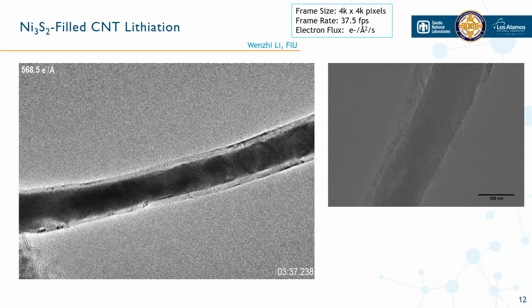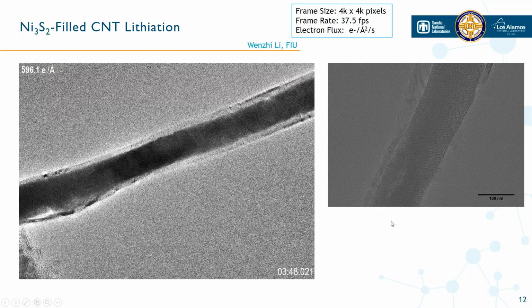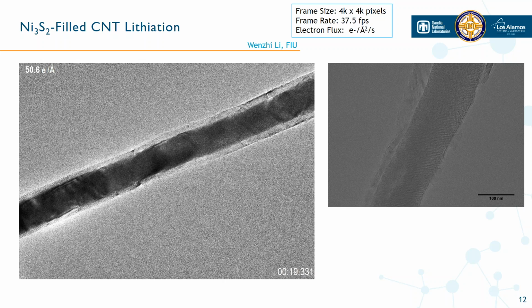This is just showing the high rate capabilities of this camera, and also a very large field of view, so that we don't have to physically move the sample holder while we're collecting the data. We can just set it up and let the camera collect as this process is occurring, even though the wire is moving a pretty large amount over time. Okay, so if we go to the next slide.